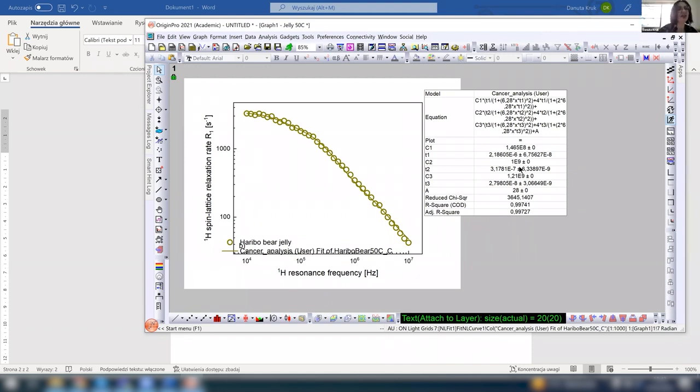I think one never should go above 3. Because first, you see, people are saying that if you have a sufficient number of parameters, you can fit whatever you like. So the credibility of the fit will be low. However, you can start with 3.